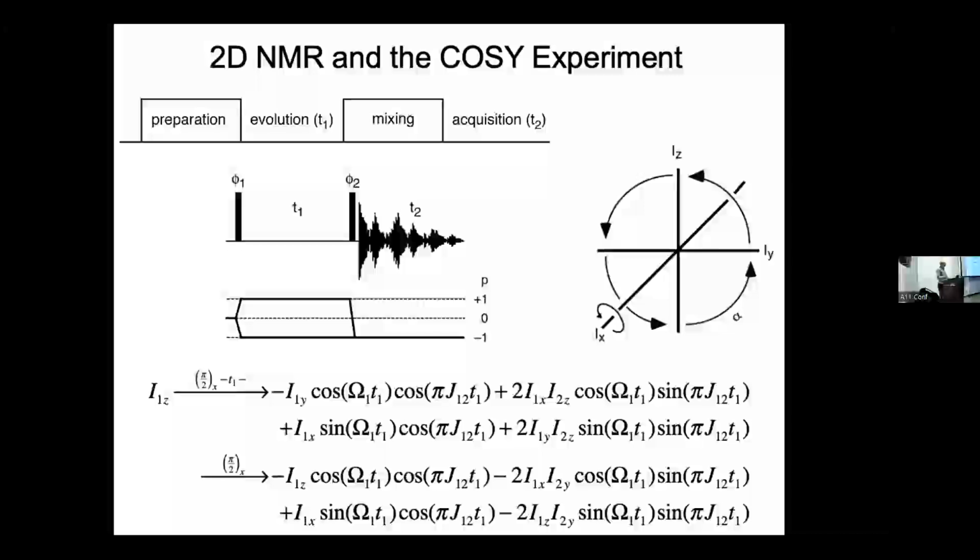Now we can always rotate the phase. Normally I will say that IX means an absorptive line shape, and IY means a dispersive line shape. You'll see more about what those look like shortly. I'll refresh your memory as to what they look like.